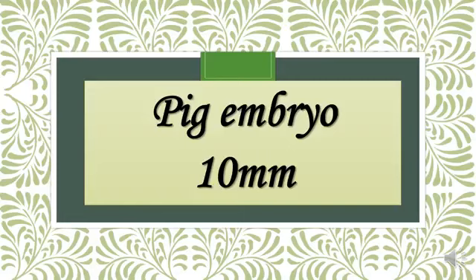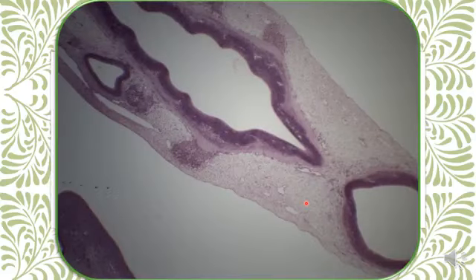Here is the second slide, transverse sections in the pig embryo, 10 millimeter. Here in these structures you can see two parts of the neural tube. Here this is the neuromeres of the myelencephalon and mesencephalon.